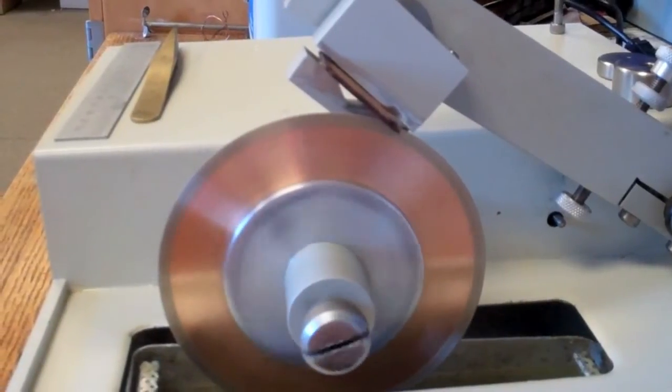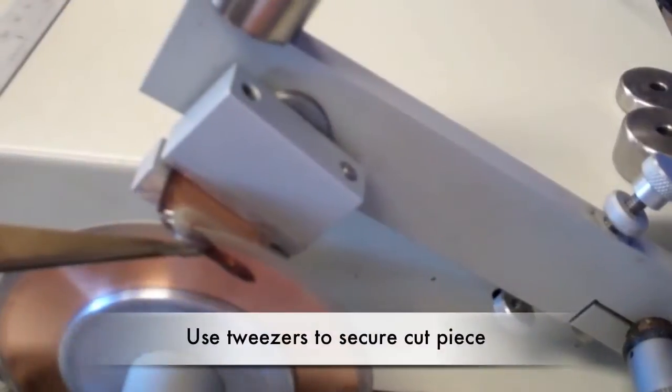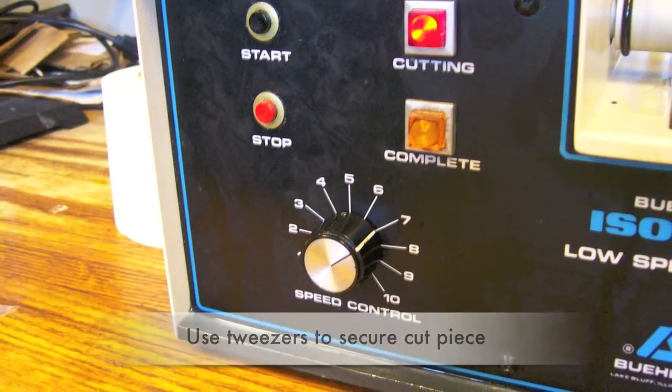Softer materials take between 30 and 90 seconds. When the cut is almost completed, use a pair of tweezers to secure the cut piece. When the cut is complete, you can stop the machine using the red stop button.